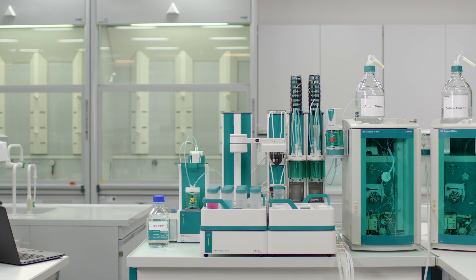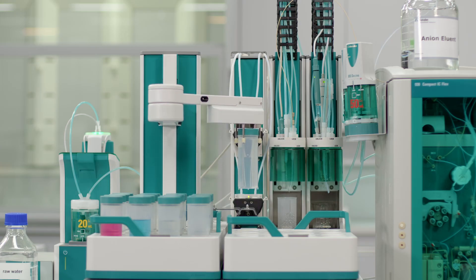A full analysis follows these steps. The sample beaker is transported from the rack to the workstation.